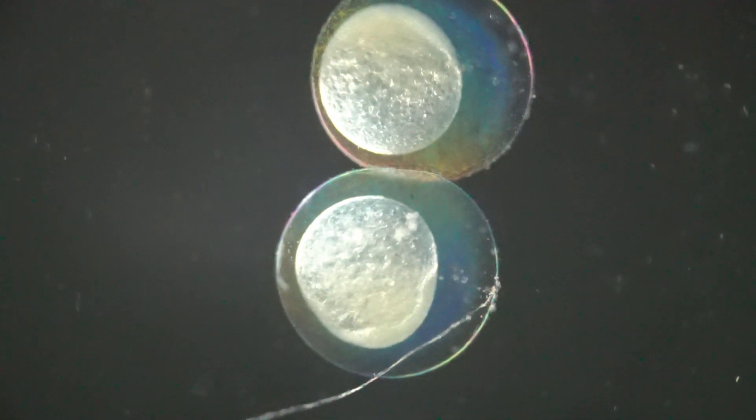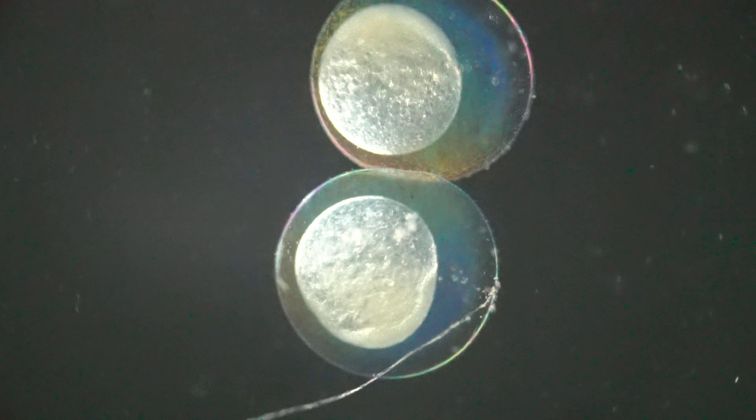So today we're going to observe the development and hatching of some nanoblue tetra eggs. The nanoblue tetra, known as the Tetrocharax tambopatensis, is from southern Peru from the Madre de Dios river basin.